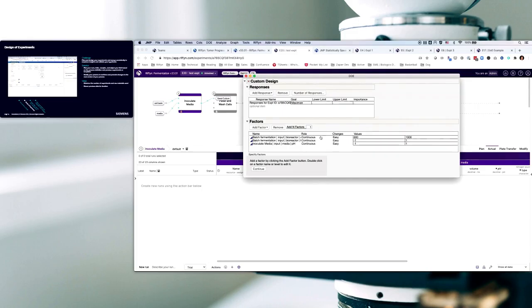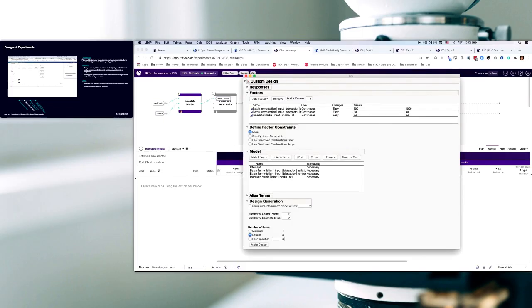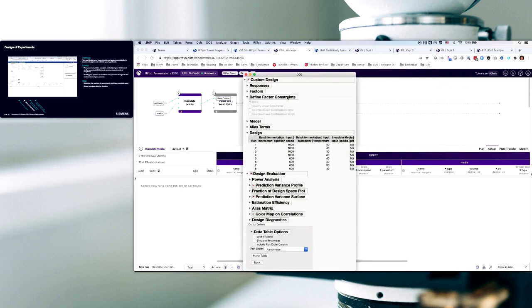So we will vary the speed, for instance, the temperature, the pH, these kinds of things. It's a simple three factors with two values variation. So JMP will come up with a simple design to say that to be able to design this experiment, you will need 8 runs, and then the system will allow you to take this design of experiment and bring it back to Riffyn.